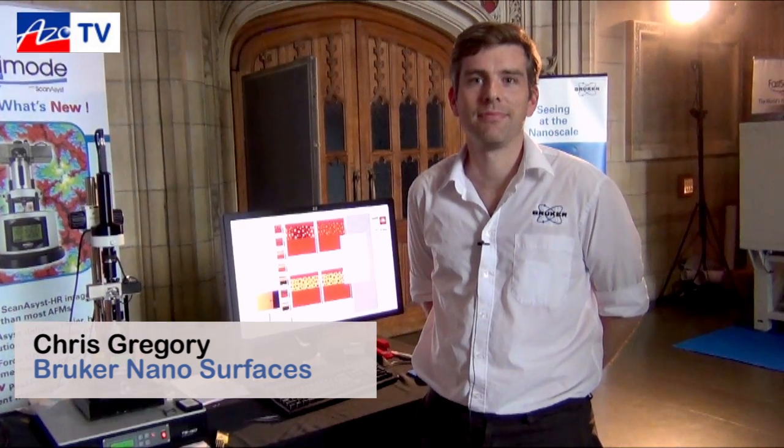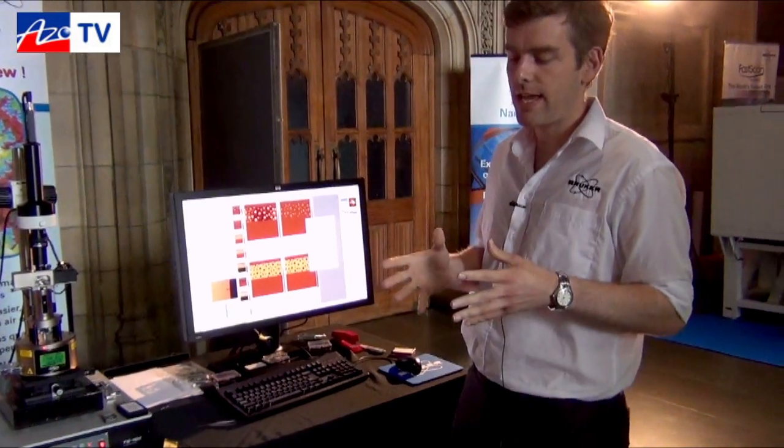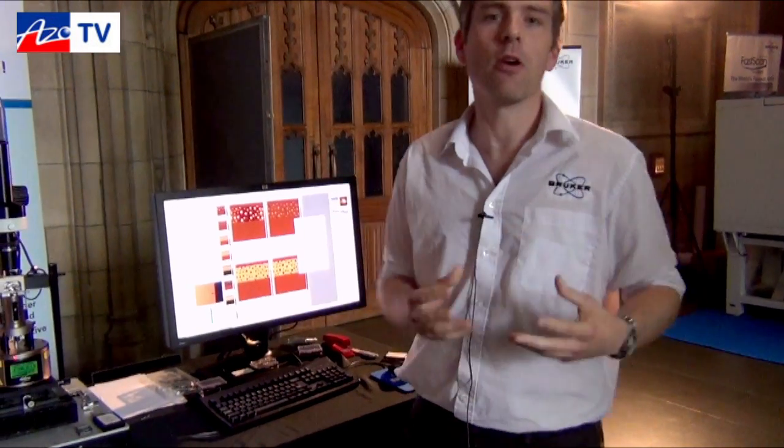Hello, this is Will Souter from Azonano. We're here with Chris from Bruker and he's going to tell us about the Multi-Mode 8 AFM. What I'm going to show you today is Bruker's imaging mode Peak Force Tapping, the way that works, some of the benefits of that, and the extra information that we can get out on the far side.